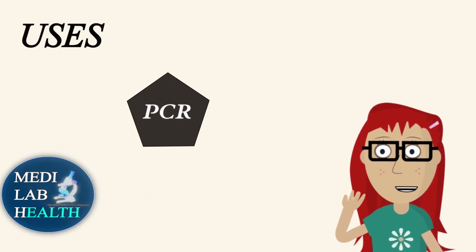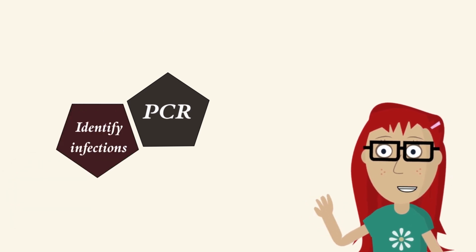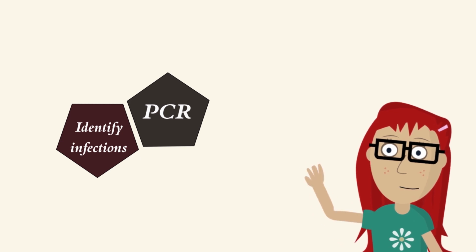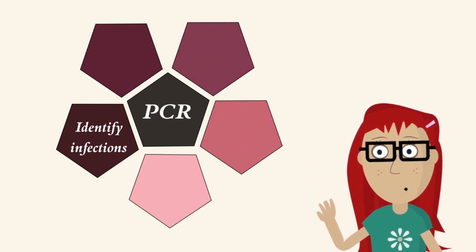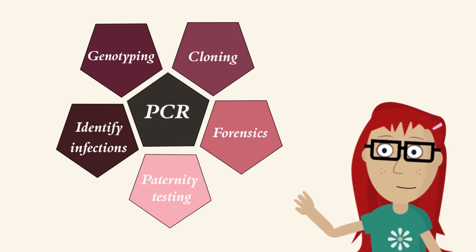PCR is used in different fields for different purposes. In medicine it is used to identify infections occurring from viruses. Apart from that, PCR is commonly used in genotyping, cloning, forensics and paternity testing.